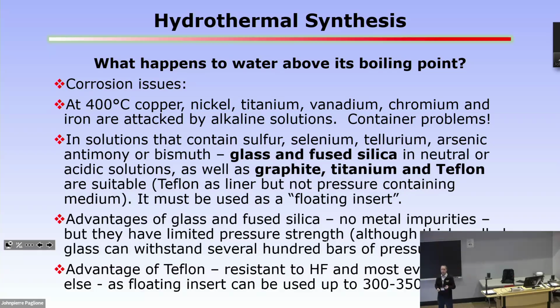This is something that contains your hydrothermal reaction. It doesn't contain the pressure, it just contains your reagents and your liquid. And you have an outer liquid as a counter pressure.